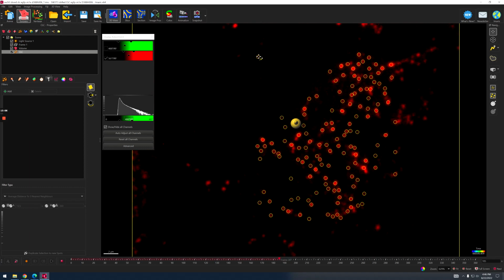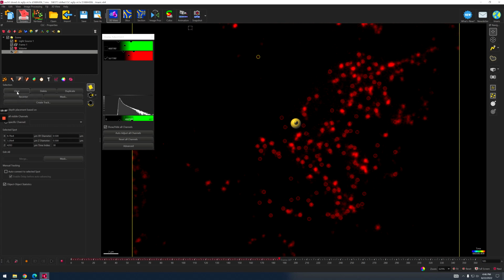The only thing that I don't like is that I don't think this module here is legit. So I click on it, and you see it turned yellow, which means it's been selected. And then you just click delete on the keyboard. No, it doesn't work. So let me use this pencil here, and just remember the only one that you want to remove is highlighted in yellow, and then you click delete. Yep, and now you delete this module.